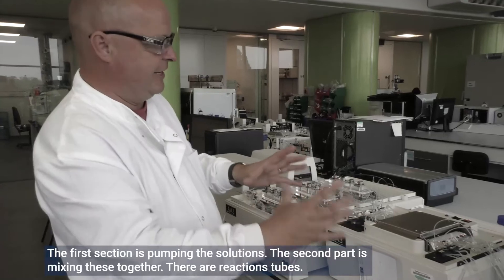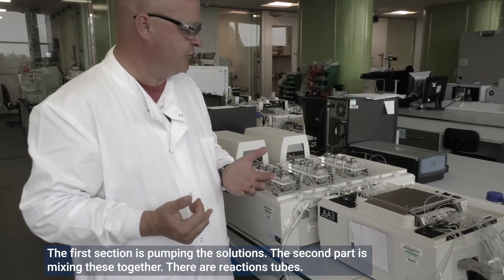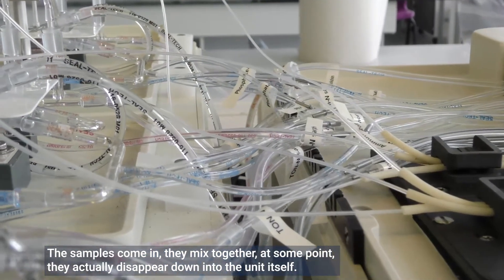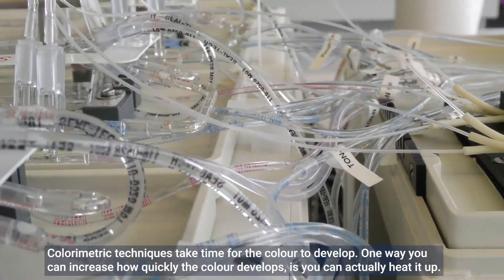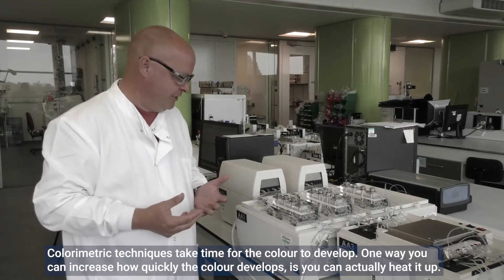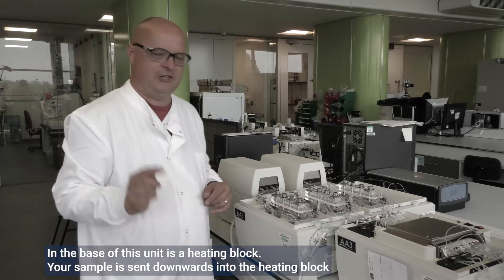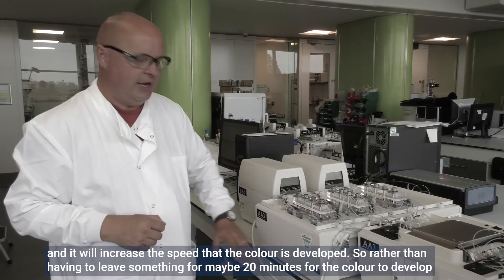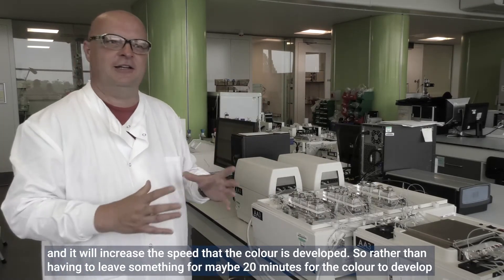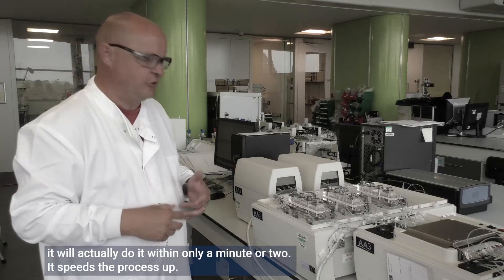The first section is pumping the solutions. The second part is mixing them together — there are reaction tubes where the samples come in and are mixed together, and at some point they are sent down into the unit itself. Colorimetric techniques take time for the color to develop, and one way to increase the speed is to heat the sample. In the base of this unit is a heating block, so your sample is sent downward into the heating block — this increases the speed at which color develops from maybe 20 minutes down to only a minute or two.